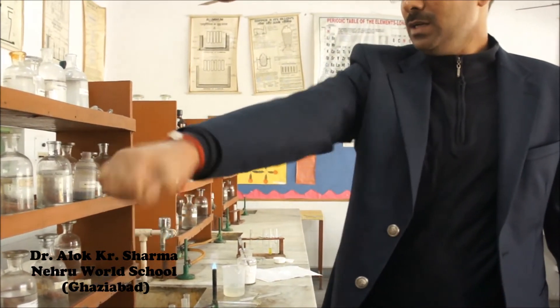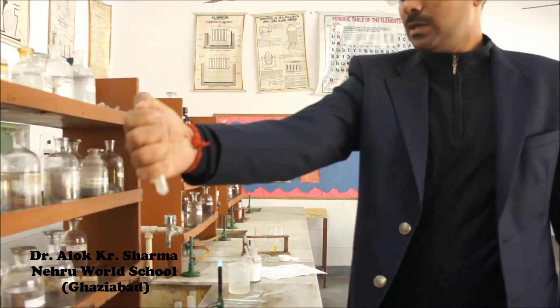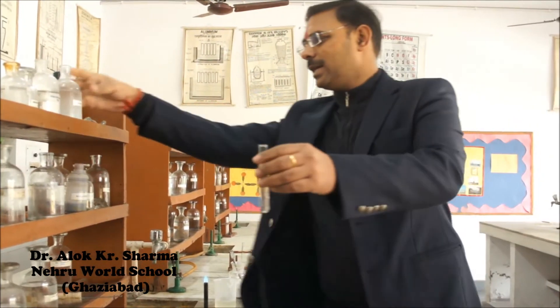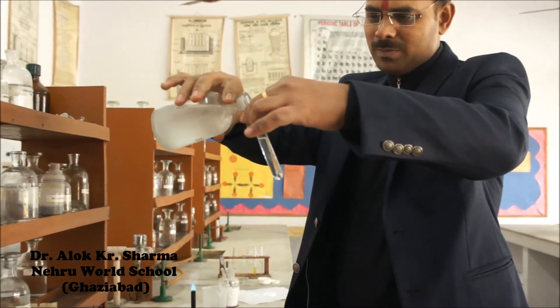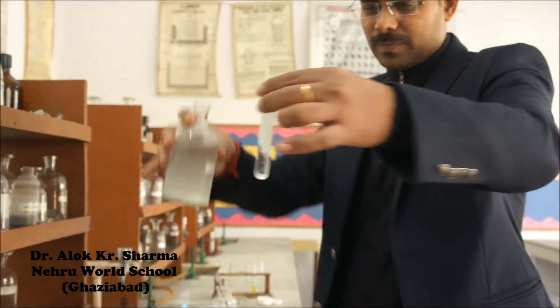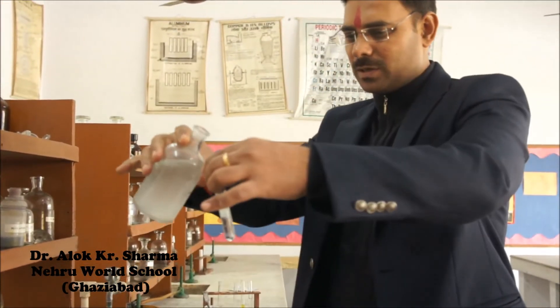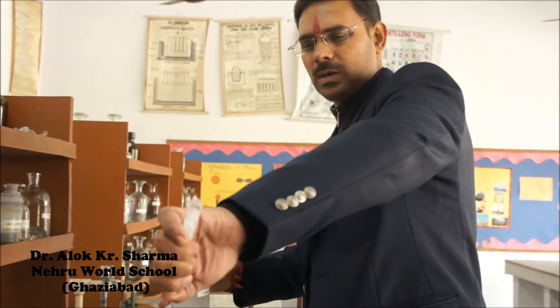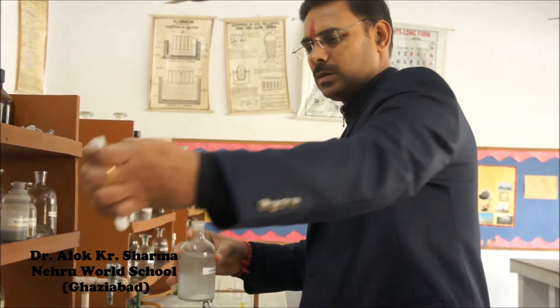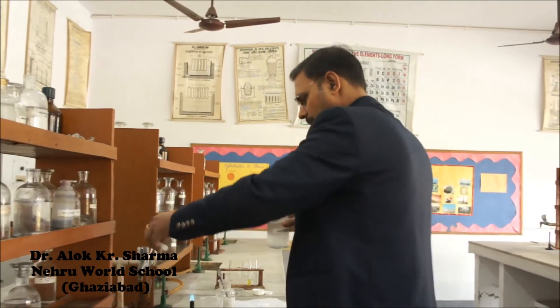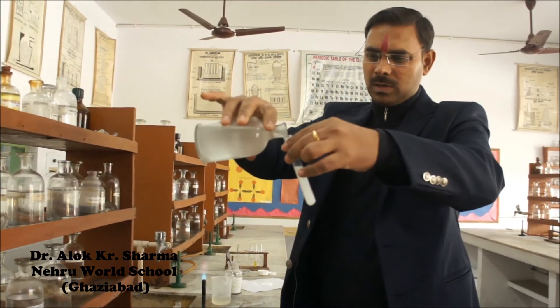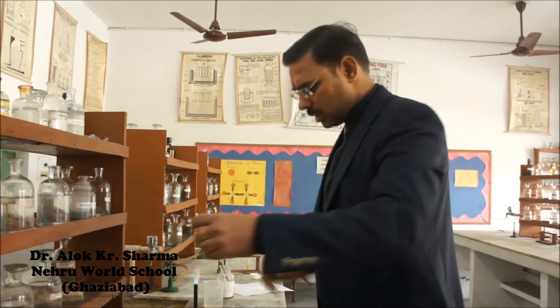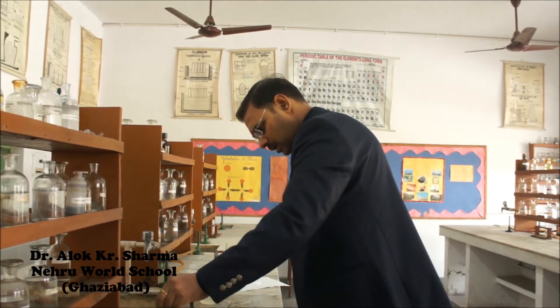First dissolve the precipitate, then add ammonium oxalate. A white precipitate comes — this confirms calcium. The white precipitate confirms the presence of calcium.